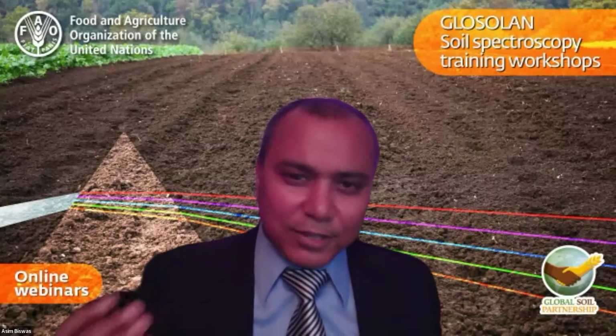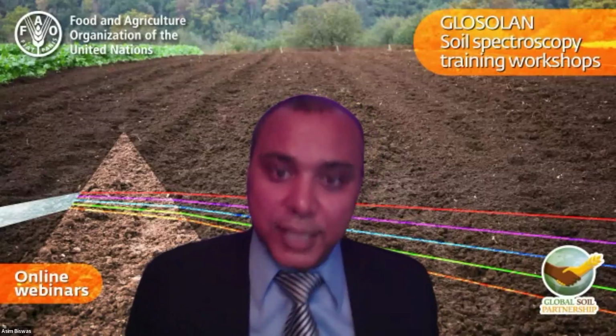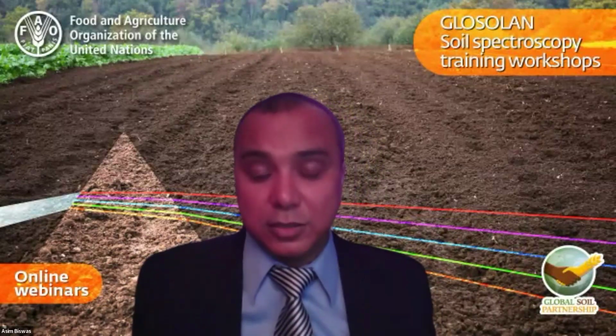Now, if you talk about, can we detect a 1 ppm variation in this case? The first question I would ask is whether that 1 ppm variability is an absolute variability, or whether it could be uncertain based on the location or the person that generated the data. Then I would come back to whether my sensor and equipment are robust enough to get the data consistently, or whether there is variation between sample collections. Even if it gives wrong data, if it is wrong 100% of the time, then you can get robustness and consistency. But if 50% of the time it gives you the right spectra and 50% of the time a wrong spectra, that has little value compared to getting the wrong spectra 100% of the time but consistently. So it's good to be 100% right about being 100% wrong.